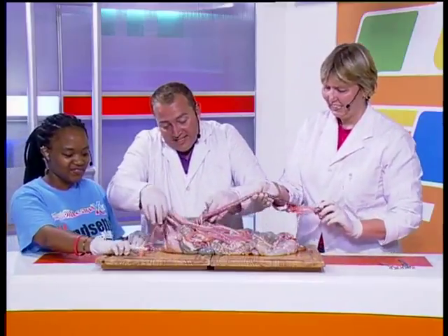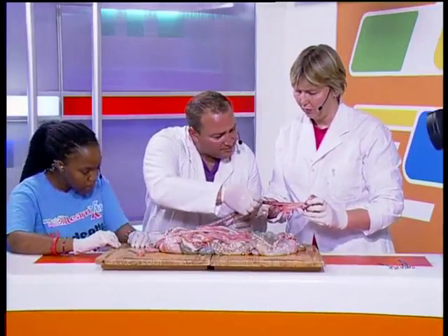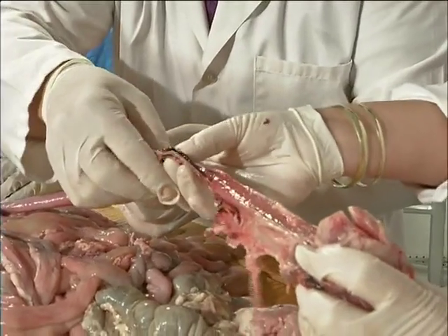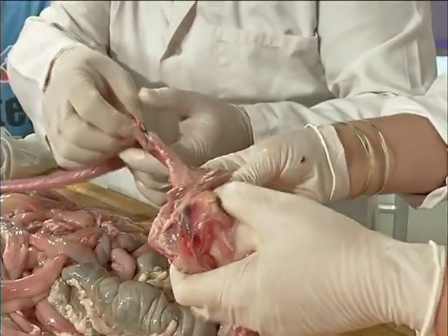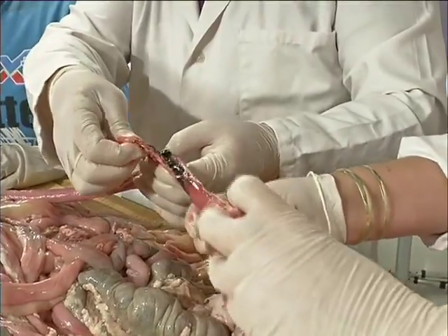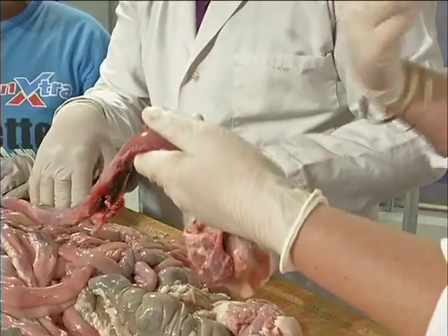Now you've got to understand, this is going to be quite difficult. What's that? Oh, that's blood. Where does that come from? Just because we cut it up. It's in the fat. Isn't there like an important blood vessel near this? A very important blood vessel. It carries lots and lots of blood. Because where's it going to go?